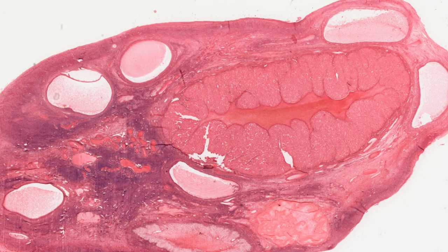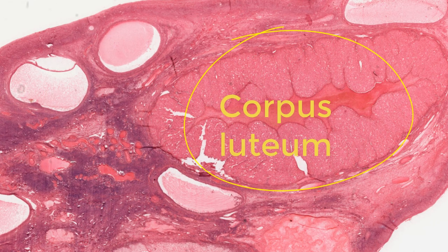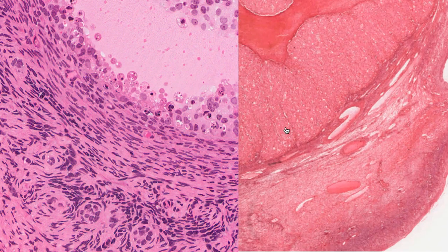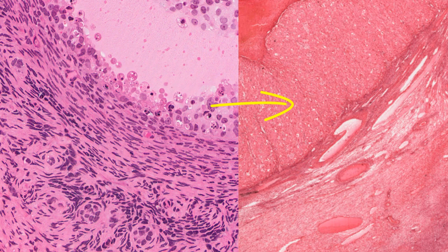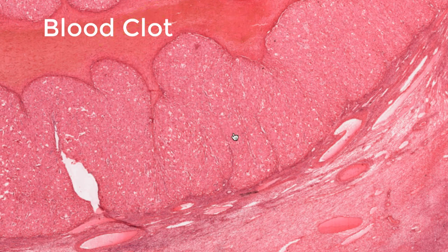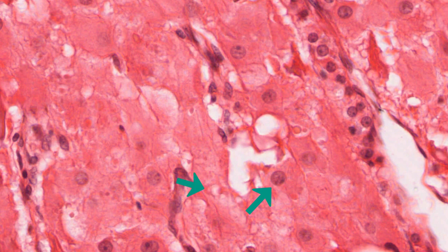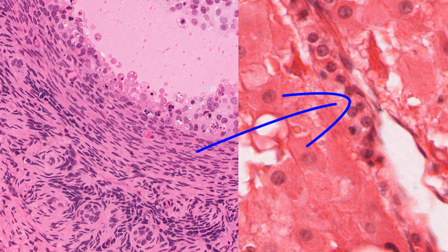After ovulation, the ruptured follicle changes to an endocrine structure called the corpus luteum, or yellow body. The cuboidal granulosa cells enlarge and form cords of granulosa lutein cells around vascular spaces. The cytoplasm of the granulosa lutein cells has numerous empty vacuoles of dissolved lipid contents. Theca interna cells change to theca lutein cells.